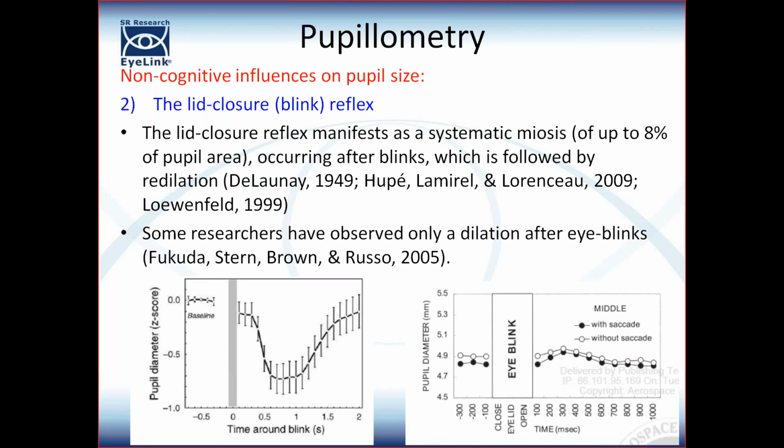In some cases they may actually be real saccades, because one of the things that the brain does is minimize the downtime to vision, and we often combine saccades with blinks. So you may stare at a single dot in the middle of the screen and blink and still be staring at it at the end, in which case you'd have a blink wrapped in an artificial saccade.